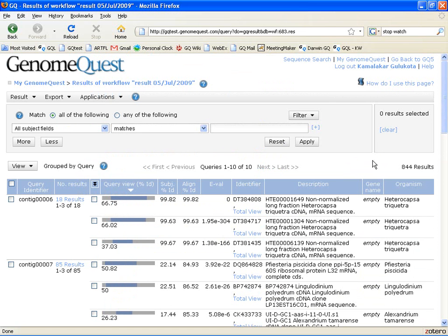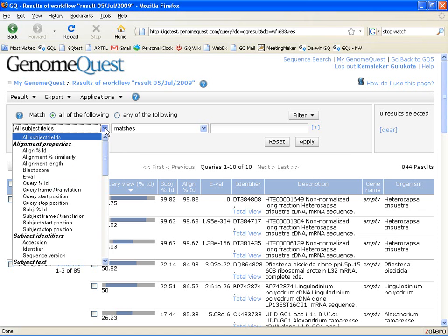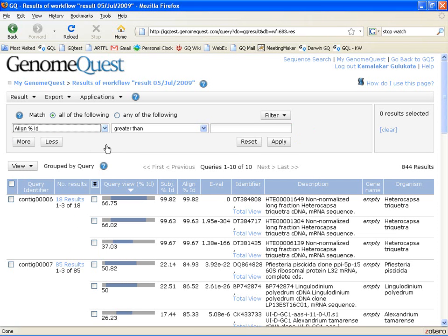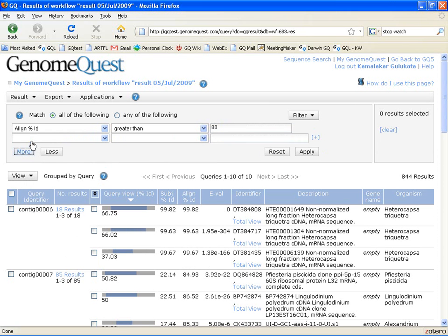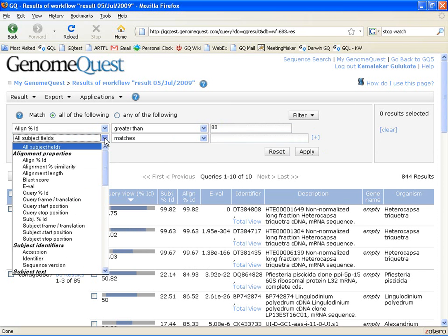The first way in which GenomeQuest helps you is by allowing you to mine these results by applying some filters. For example, I might want to see only strong alignments. Let me define a strong alignment as something that has at least 80% identity in the alignment and the length of the alignment being at least 100 nucleotides.